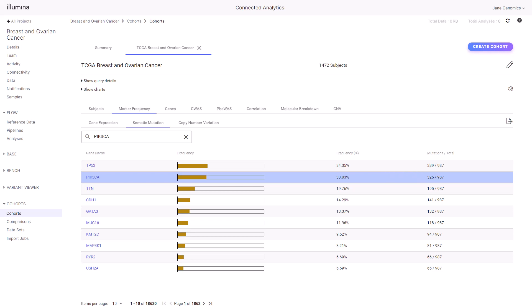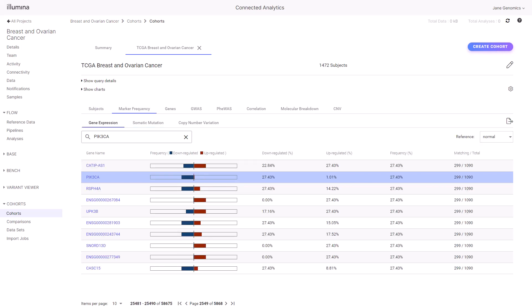Let's explore if subjects with the PIK3CA mutations have changes in PIK3CA RNA expression. Select the Gene Expression tab. PIK3CA RNA is downregulated in 27% of the subjects relative to normal samples. Select the PIK3CA gene.